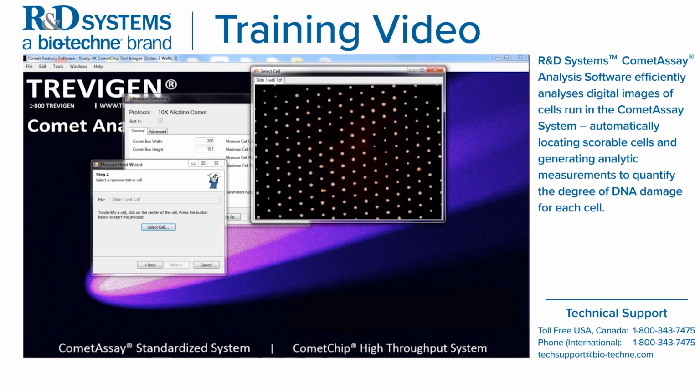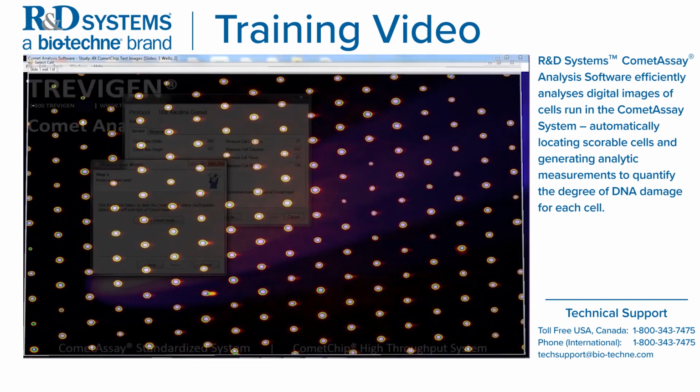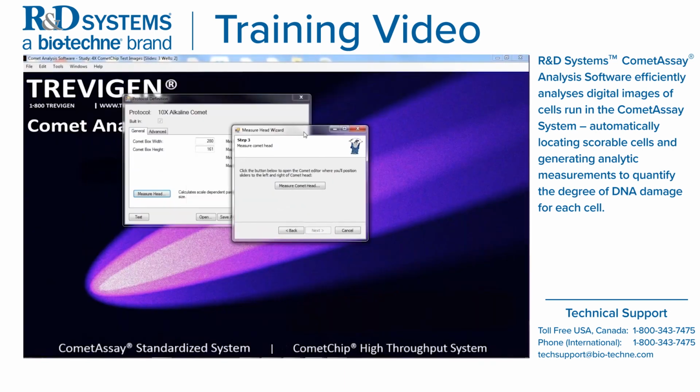The image comes up. Simply move your cursor, and I'd recommend expanding on this image. So find an untreated cell and click on the center. Okay, so it measured it. So step 3, click the button below to open the Comet editor so that we can now position to measure. So step 3, click on Measure Comet Head.